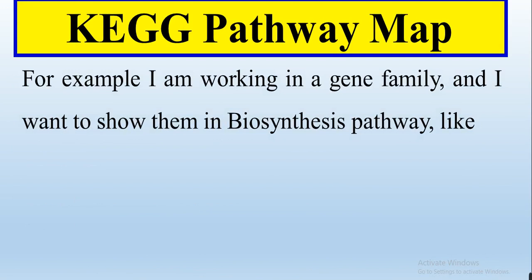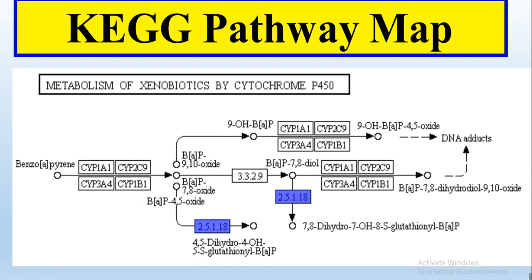For example, I am working in a gene family and I want to show them in a biosynthesis pathway. I did not know that they are working on which biosynthesis pathway and where they work. Through this analysis in TBtools, I will be able to know that my genes were working on metabolism of xenobiotics by cytochrome P450 and they are working in this type of pathway.